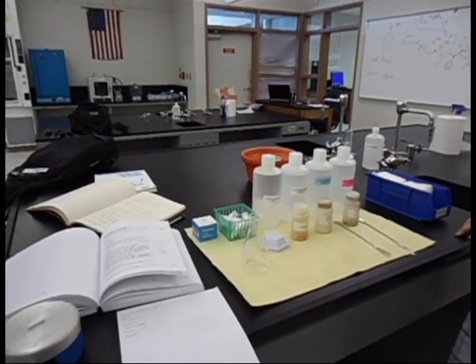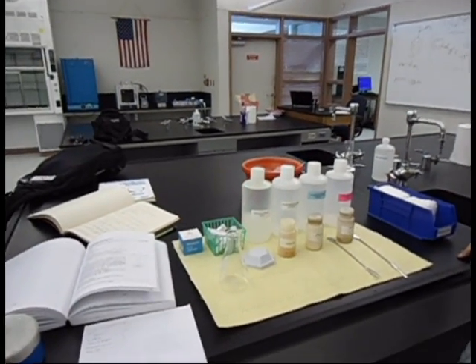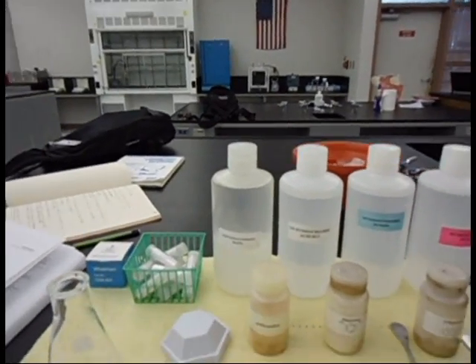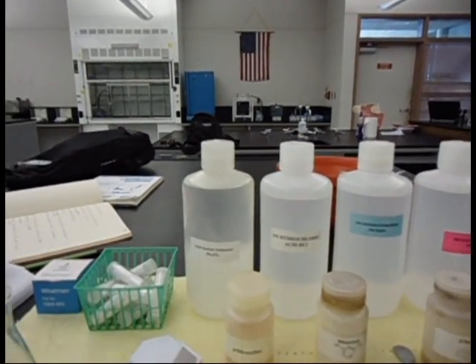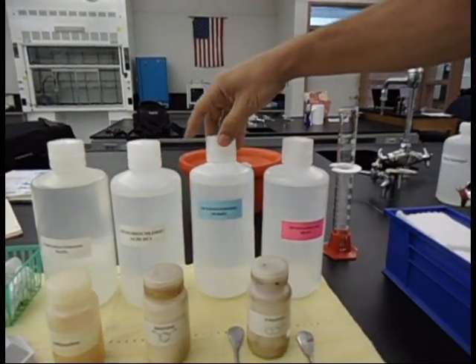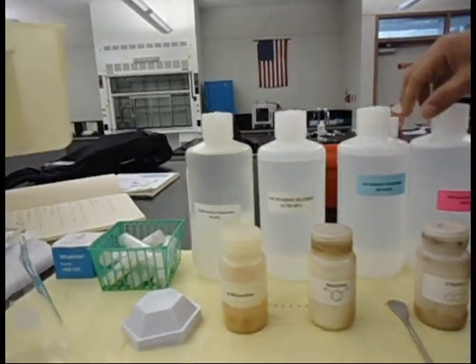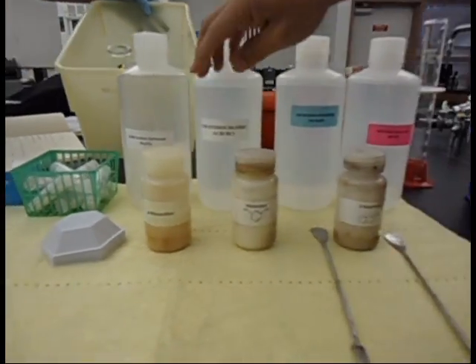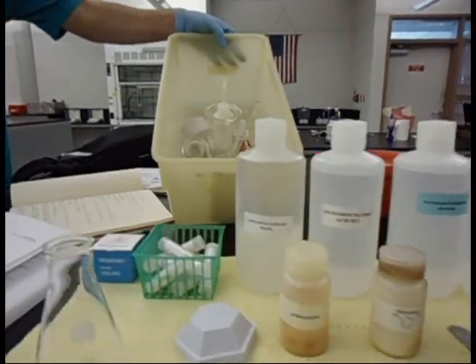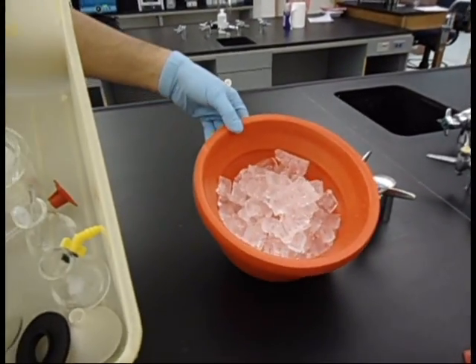This lab is the preparation of para red and related azo dyes. Our equipment includes sodium carbonate, one molar hydrochloric acid, one molar sodium hydroxide, three molar hydrochloric acid, p-nitroanilin, resorcinol, 2-naphthol, and related glassware, an ice bath, and a hot plate with a stir bar.